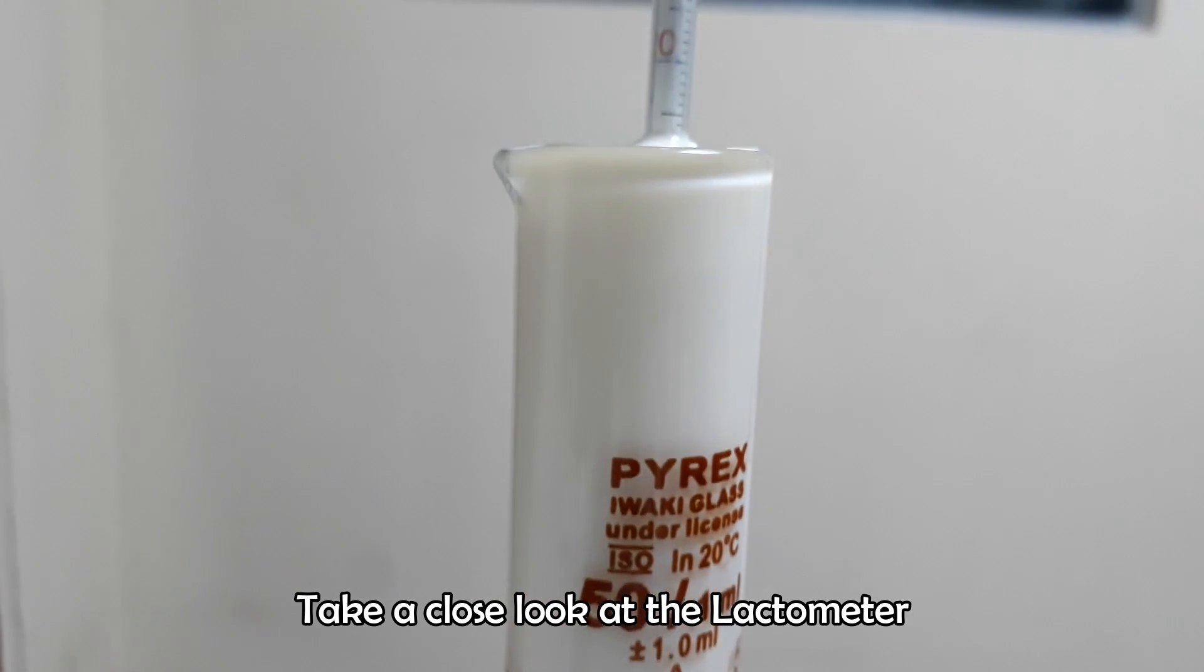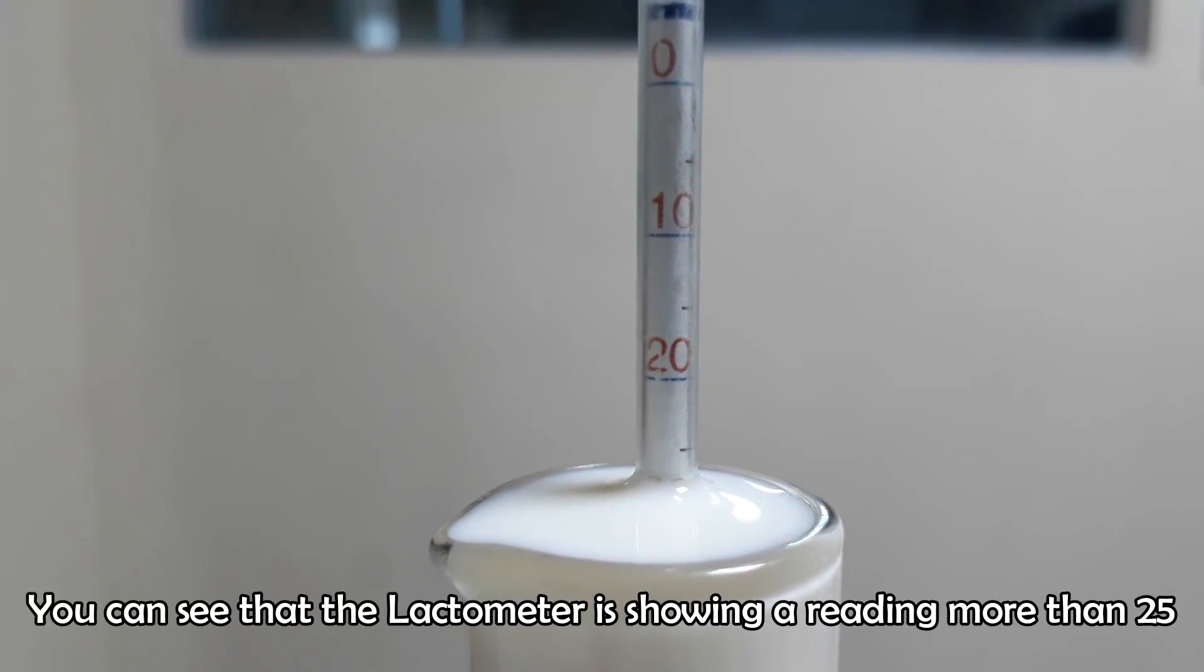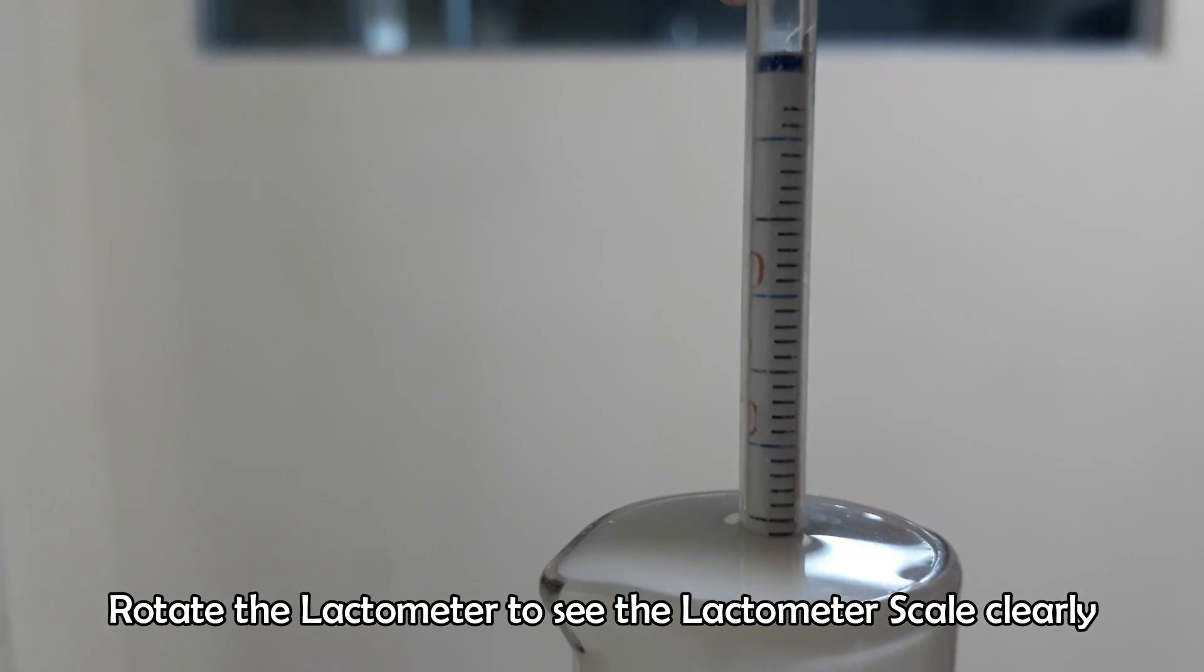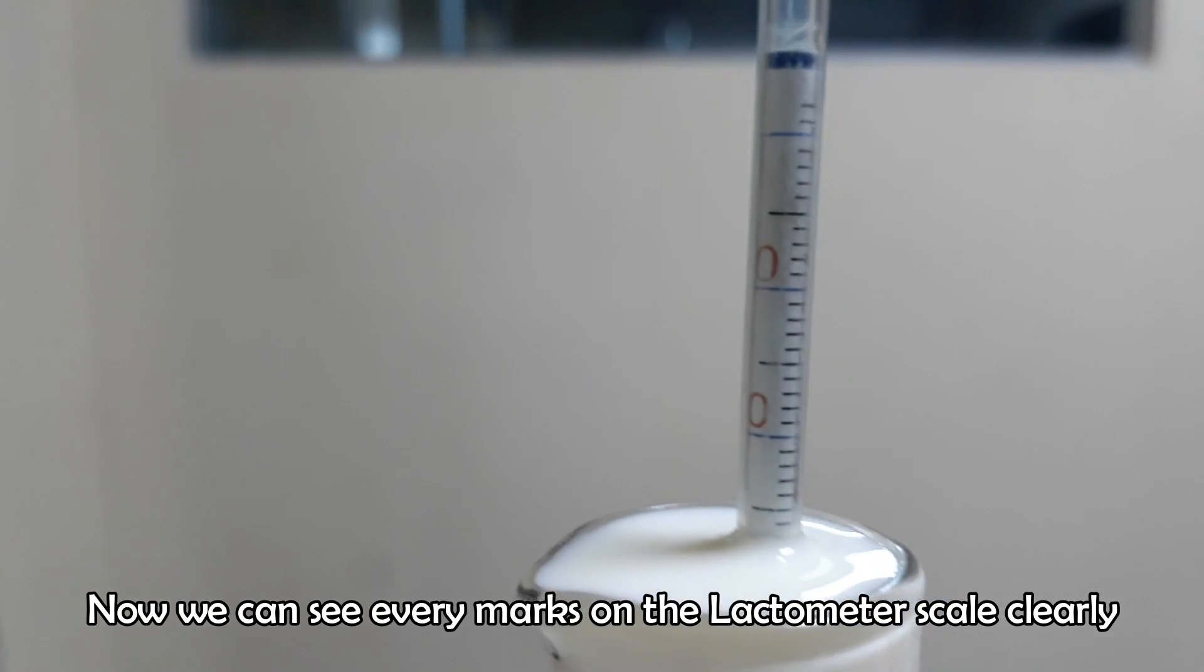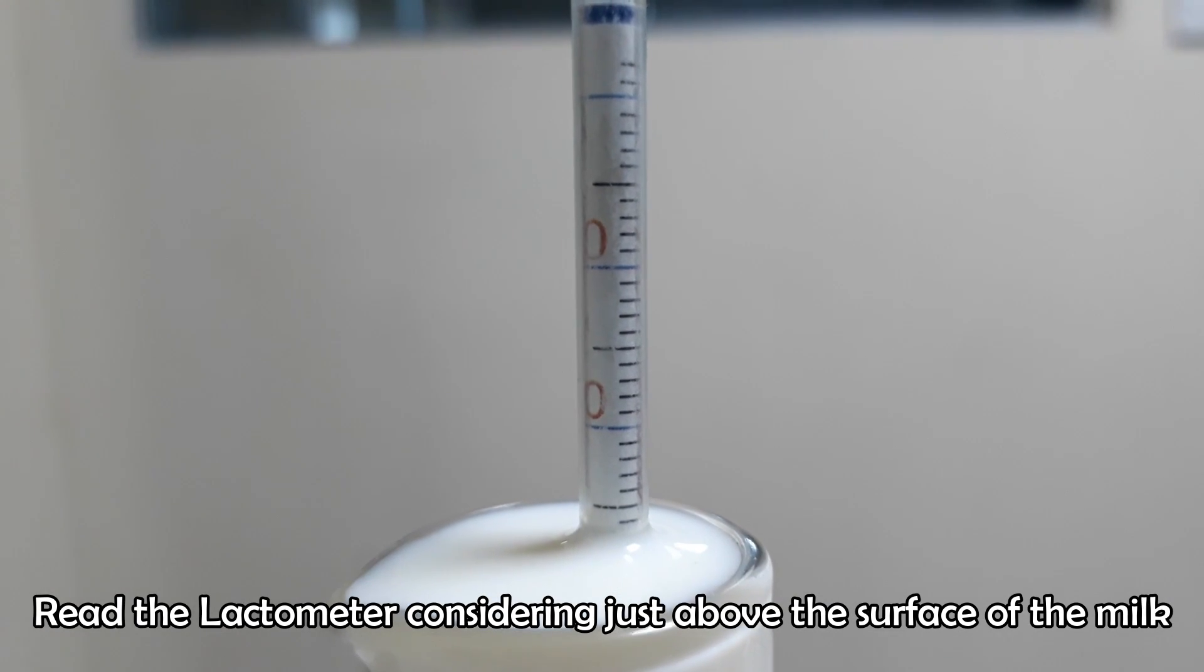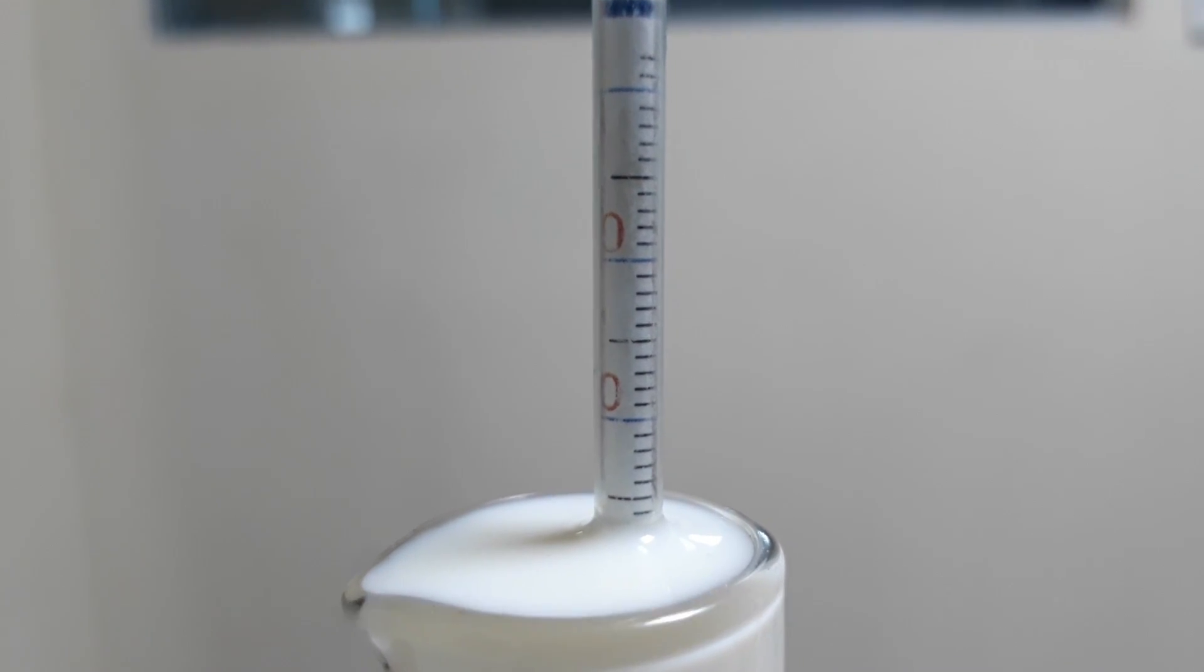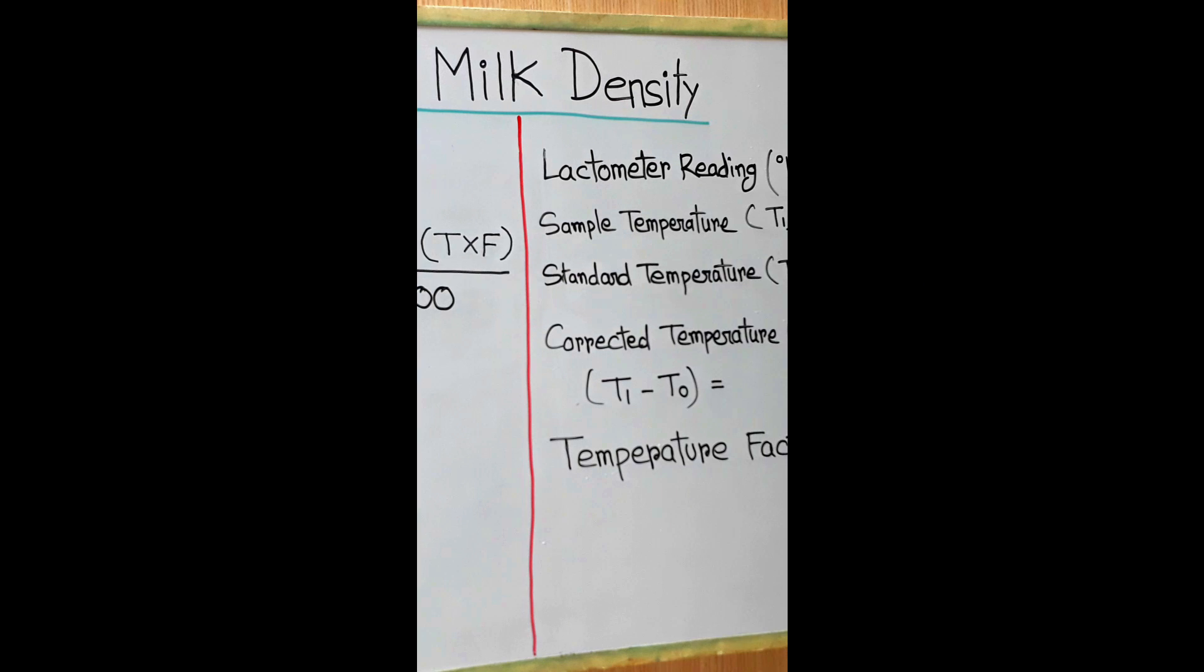Take a close look at the lactometer. You can see it's showing a reading more than 25. Rotate the lactometer to see the scale clearly. Read the lactometer just above the surface of the milk. We got the lactometer reading as 27 degrees. Note the reading. Now we will calculate the density of the sample.